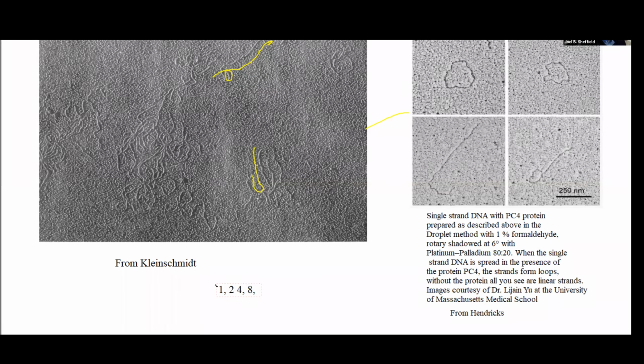Okay? Relationships from one to the next. And what he was doing was actually taking DNA strands. This is before we all fully appreciated the DNA structure. What he was doing is taking these DNA strands, which were pretty much chromatin, that still had the histones in there, which are in the nucleosomes, and looking at pieces of DNA that are broken off at different numbers of nucleosomes. Kind of an amazing bit of work.